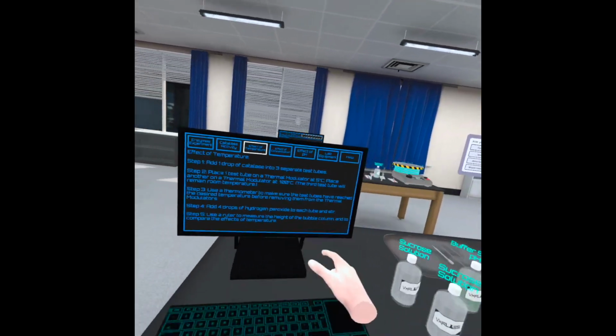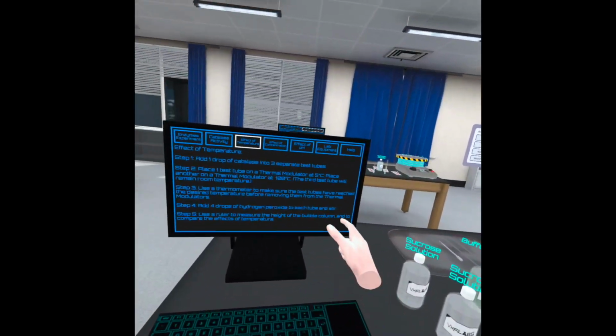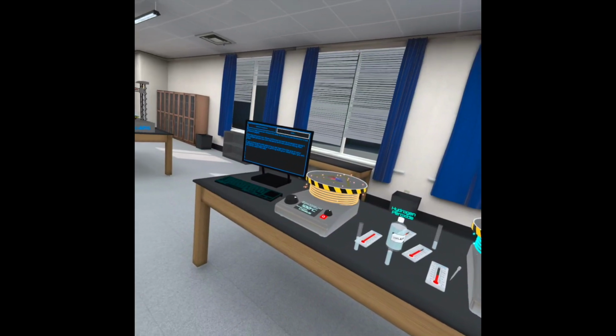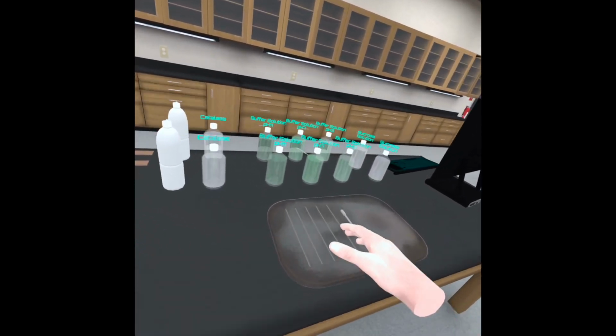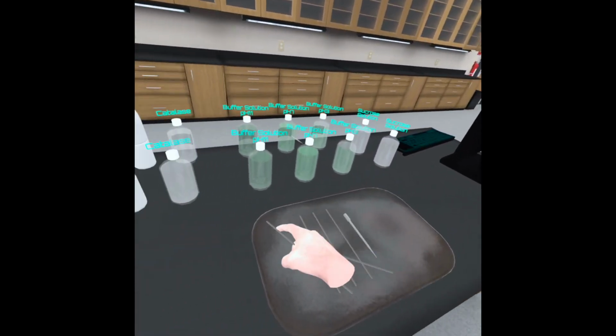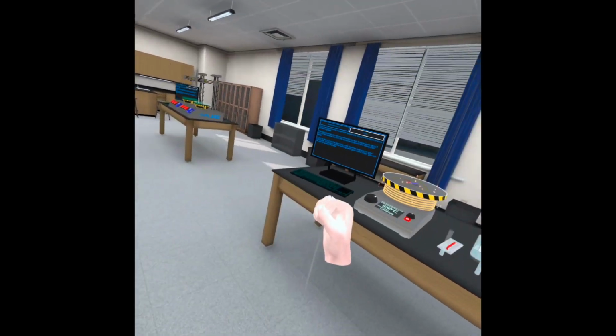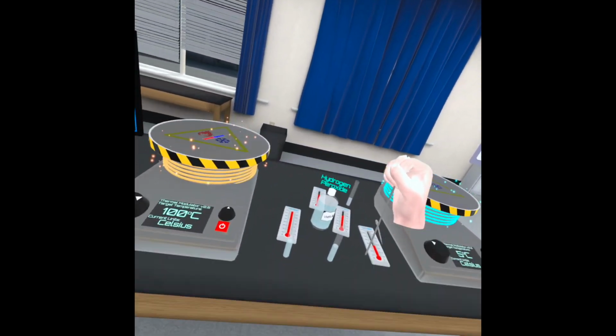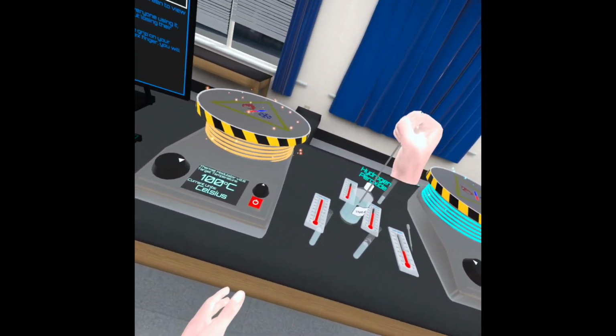and it's really important for you to know when the reaction is starting to take place, you're also going to observe bubbles of oxygen being produced. This is slightly different from outside of the virtual lab, whereby as soon as the substrate and the enzyme come into contact with one another, they would react.